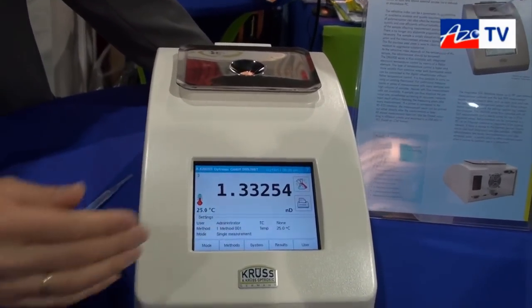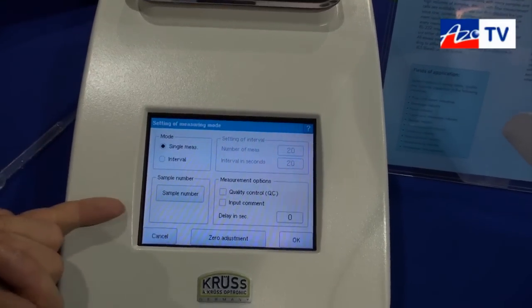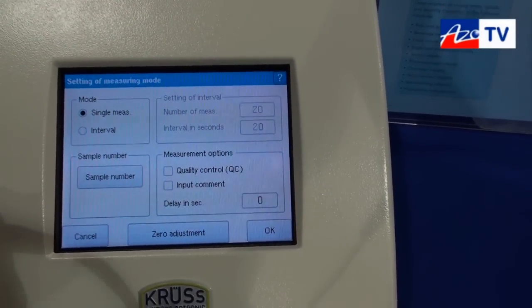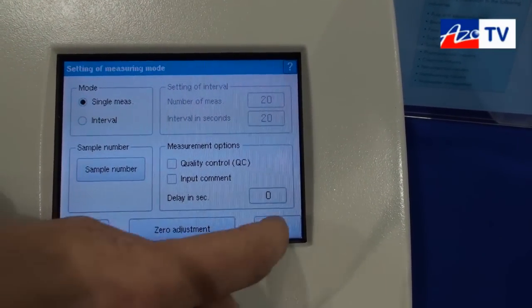All the settings you do on the touchscreen. You have different modes which you can configure, with interval measurements and single measurements. You can add information to a measurement directly on the screen.